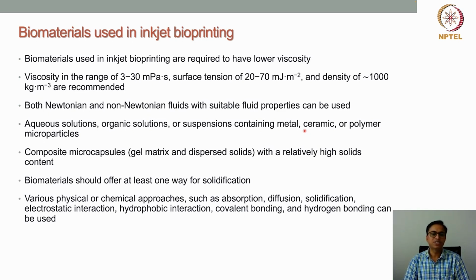Various physical or chemical approaches have been used to achieve the solidification process so that the structure gets stabilized. Something like absorption. Suppose after the generation of droplets and placing them on the stage or substrate, they get absorbed very fast. In this way, solidification can be achieved.